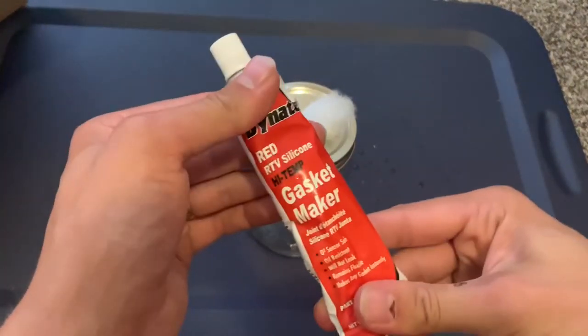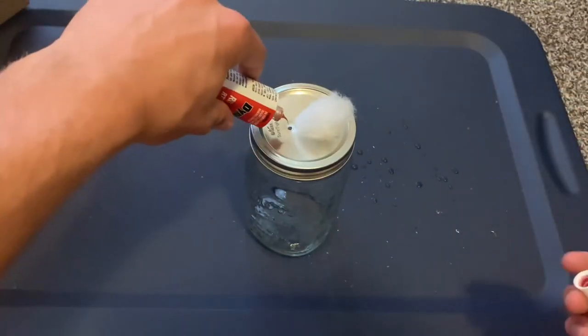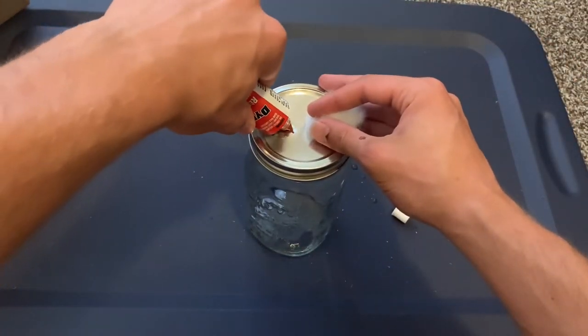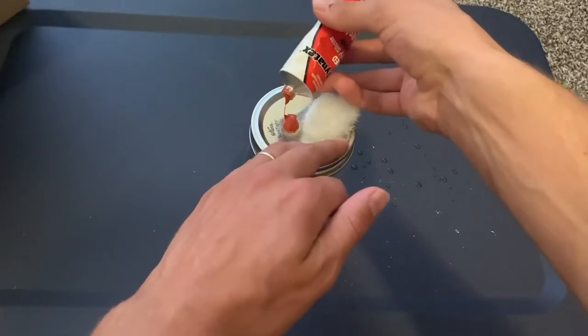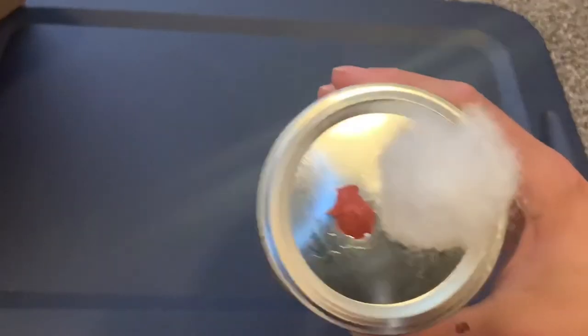Take your high temp gasket maker and just fill that second smaller hole to make a little injection port. That's all you have to do, and you can use these for liquid culture and spawn.